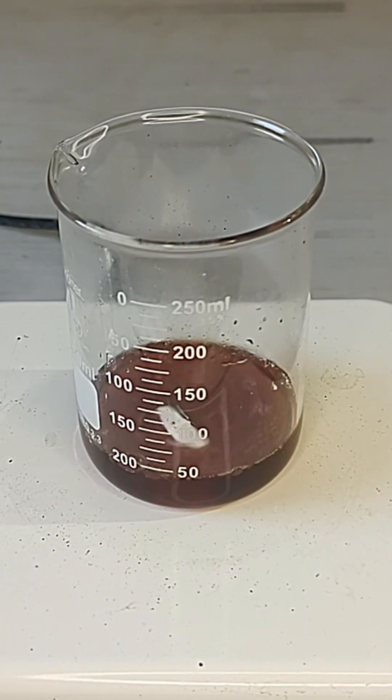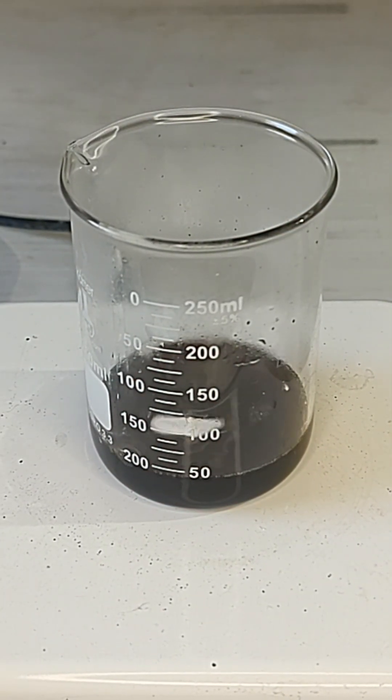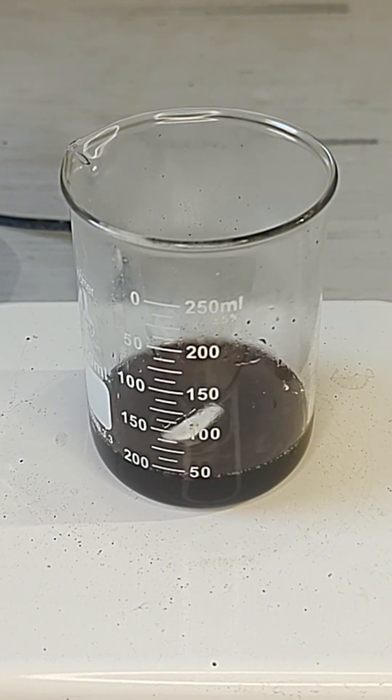I was gonna do chips and then that — I inhaled a lot of that. When dissolving, the solution gets even hotter and the smell it lets off is like nothing you've ever smelled before.